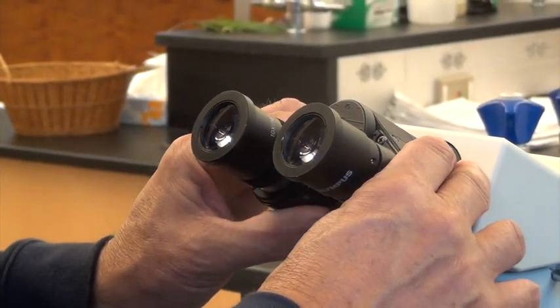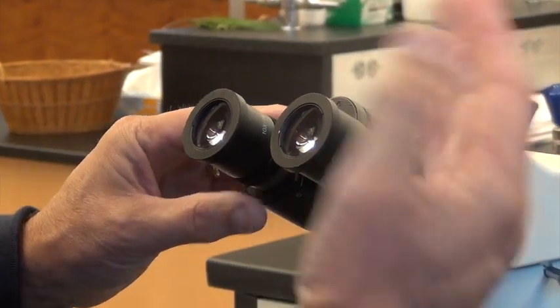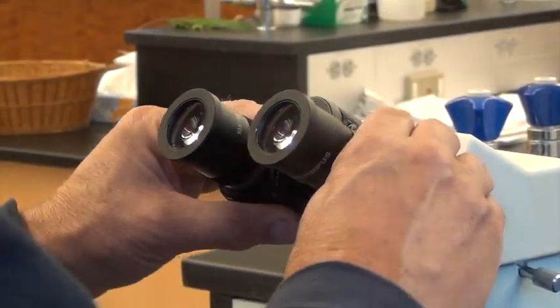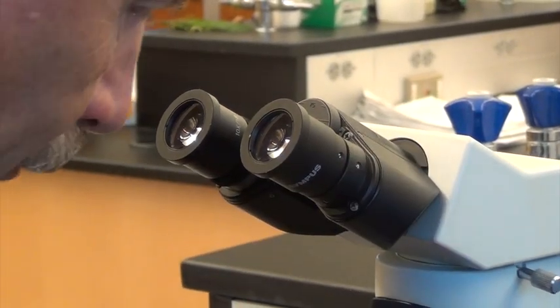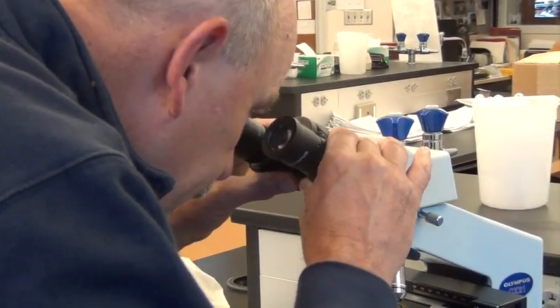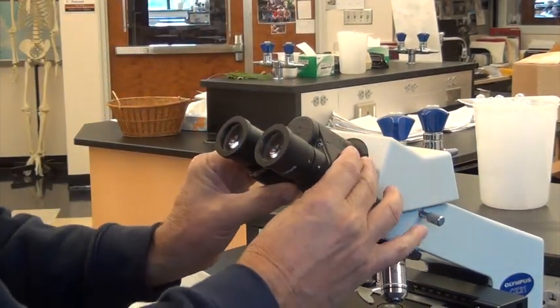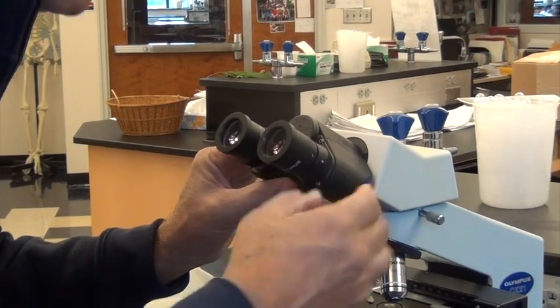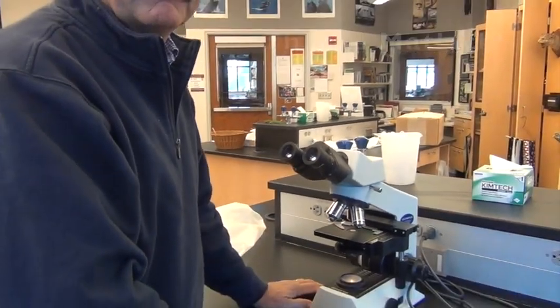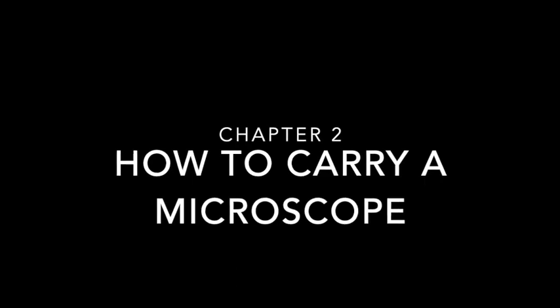This microscope is a binocular microscope, meaning we have two eyepieces. Some of you may be using a monocular microscope. If you're using a binocular, you need to keep both eyes open and sometimes you'll have a double image. A few tricks to get rid of the double image are to move the two eyepieces or oculars up or down, and to move your head closer or away from the ocular, and that should give you a single circle image. When carrying a microscope, always put one hand on the arm and one hand on the base — always use two hands.